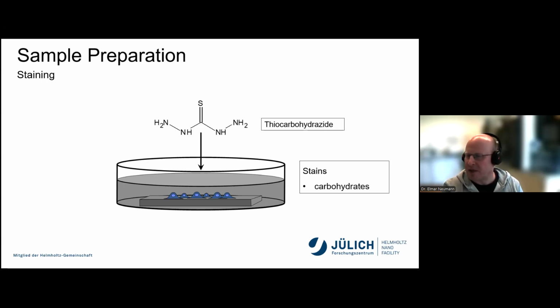The first one was a lucky case, where we tried staining and fixating only with osmium tetroxide. But for the others, I cannot show you any comparison except that you see something, but not in all cases. So this is what literature says and the protocols we apply here.